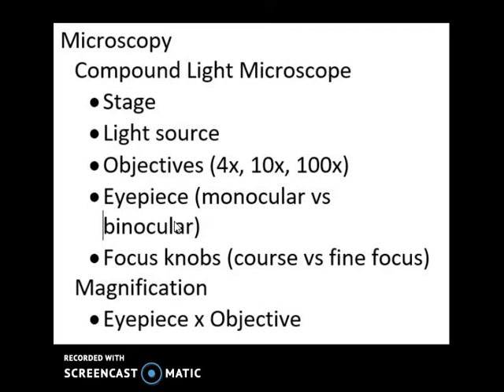Another thing that you're going to have to fiddle around with is your depth of focus. Basically, it's a 3D image that you're looking at with those thicker samples. You can focus light onto the sample, or you can focus light through the sample. Each will give you a different view of the different components of the slide. So make sure that you're working with it to see the whole slide and not just some of it. Okay, I think that's all for the microscope.